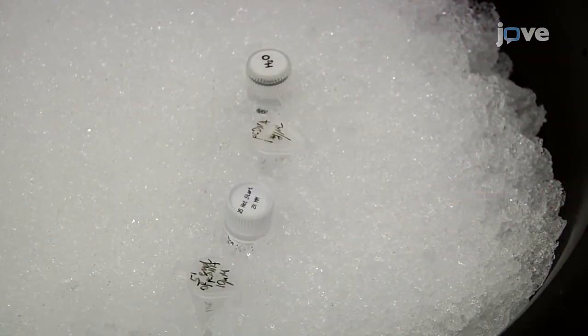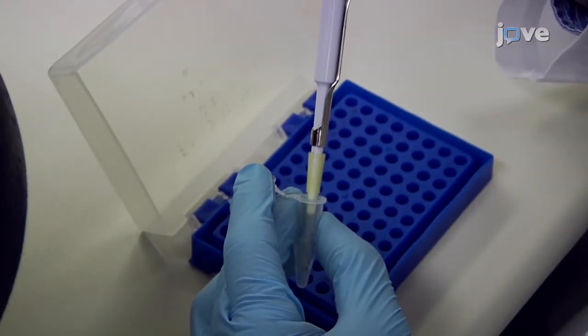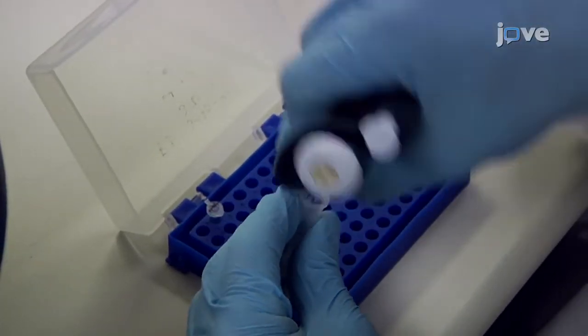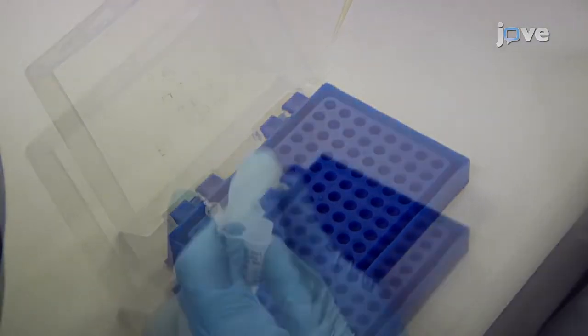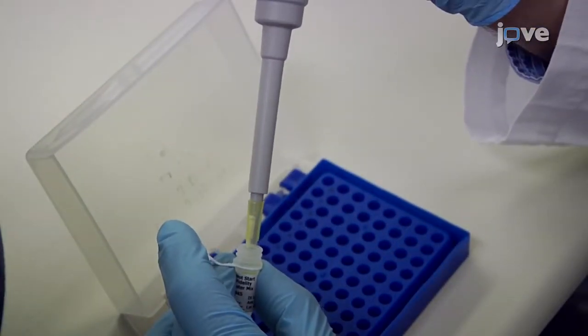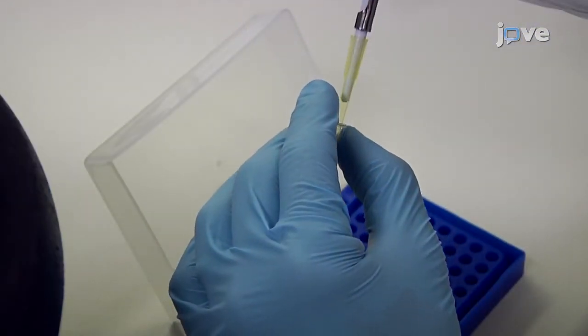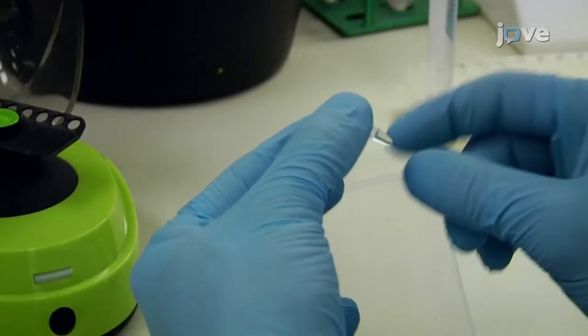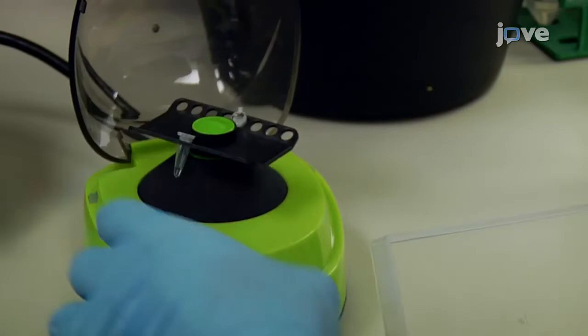Assemble the PCR reactions at room temperature by combining 2.5 microliters of 10 micromolar of each primer, 1 microliter of the 1 nanogram per microliter template DNA fragment, 25 microliters of hot start proofreading DNA polymerase, and 19 microliters of water. Mix the tube by gentle flicking and collect the liquid droplets by brief centrifugation.